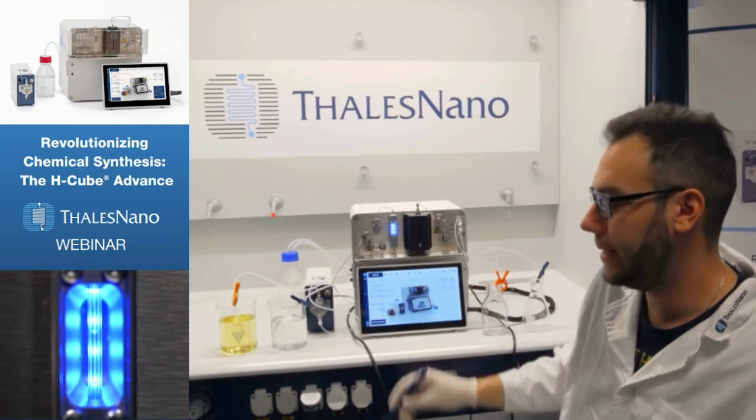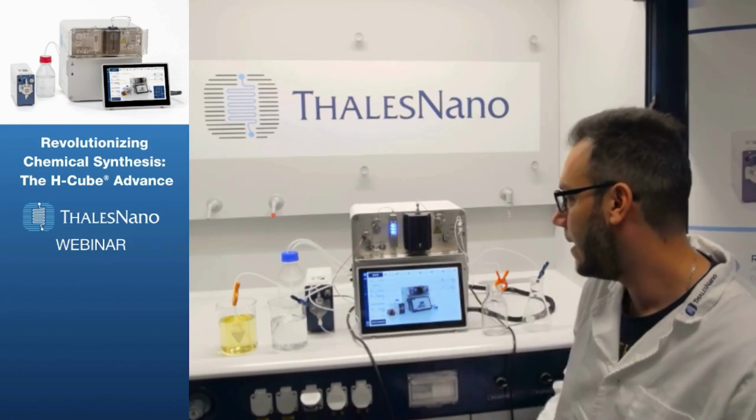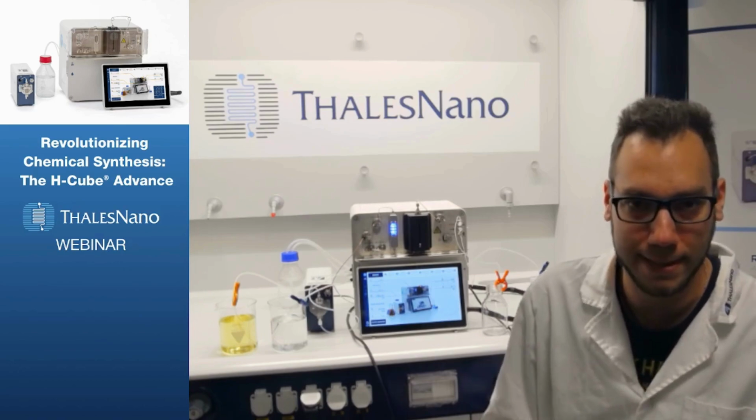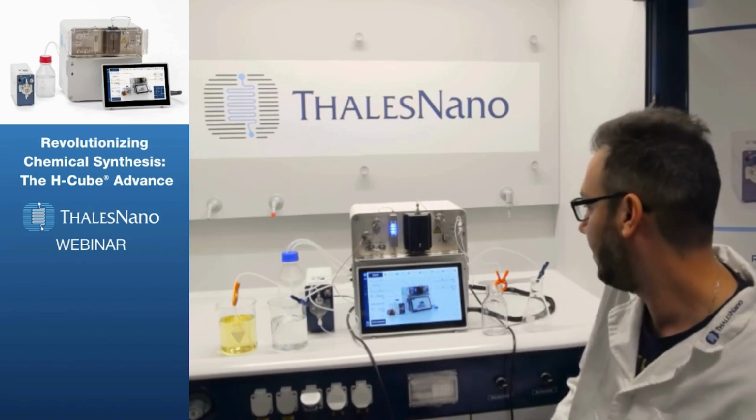see the gas-liquid mixture in forms of bubbles passing through this little cuvette. And that's just, once again, useful information for the user that allows the visualization of the mixture that's already passing through the system or not yet.